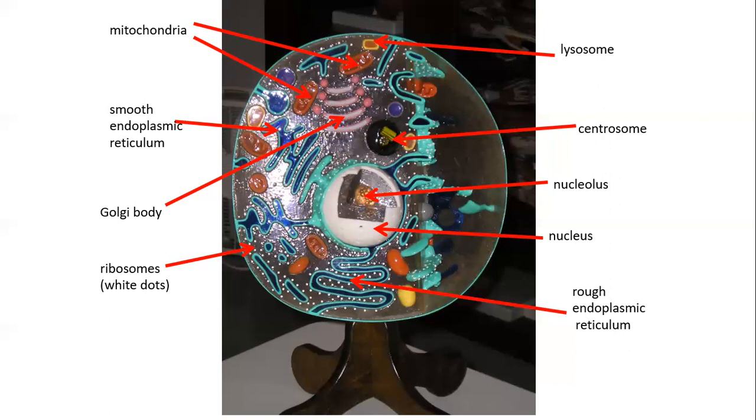We are in the domain of the cell, and during this week, you are learning about cells for the lecture portion of this class as well. In the lab, we take a much simplified view, focusing on available models, microscope slides, and at the very end of this lab, you'll see an experiment that's also, again, reflecting how we approach this topic in the lab.